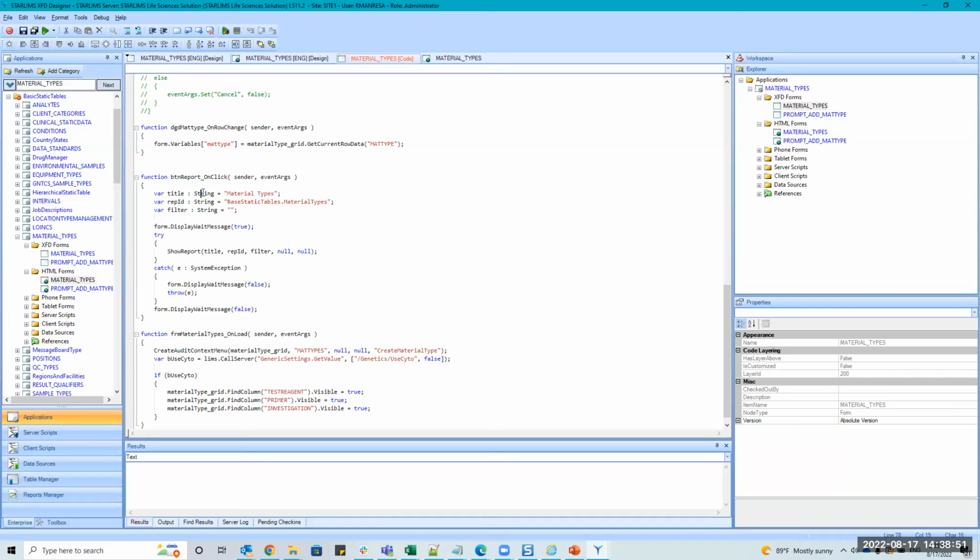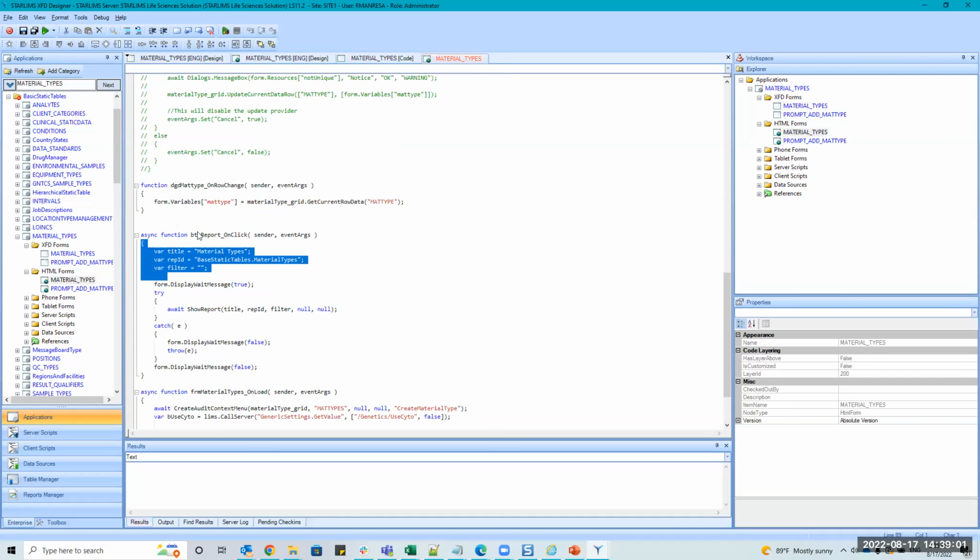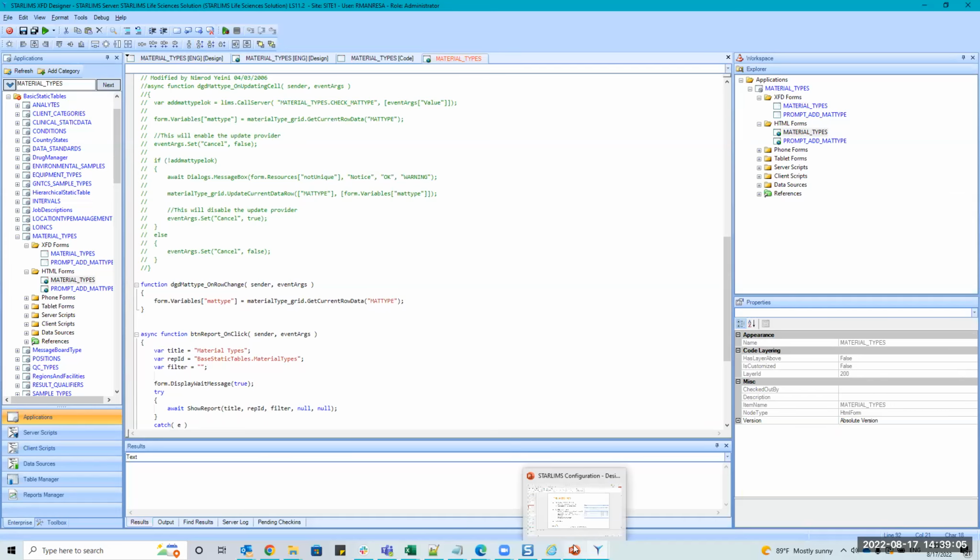It doesn't have the typecast. So this is a typecast. It's basically saying that this variable is going to be treated as a string. This is a property of this language, which is not a property over here. This is called typeless. Anyways, I need to get back to the PowerPoint because it's going to go into some of that.